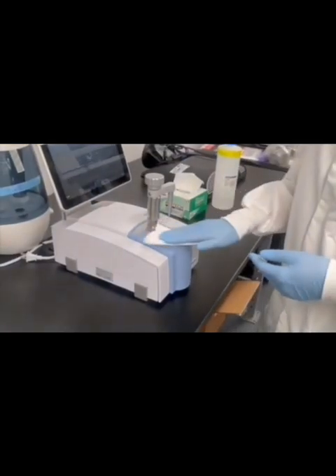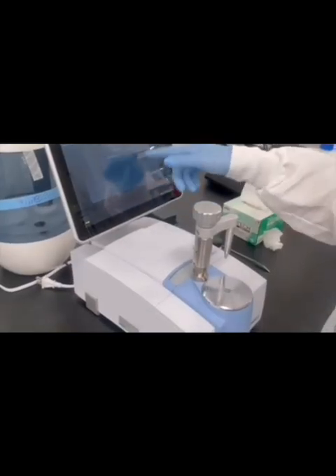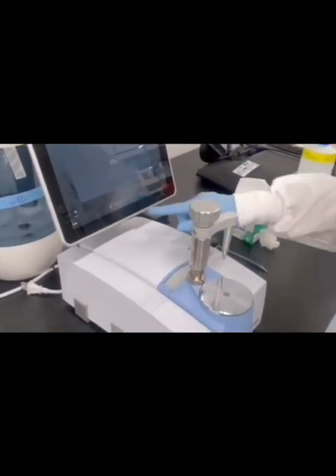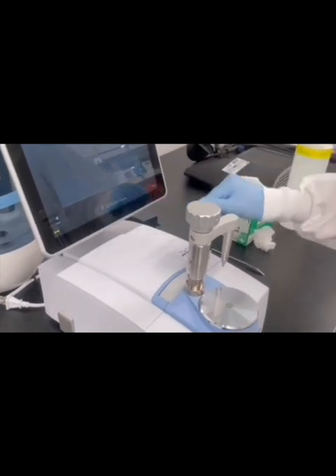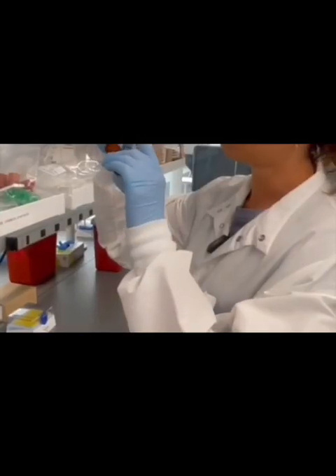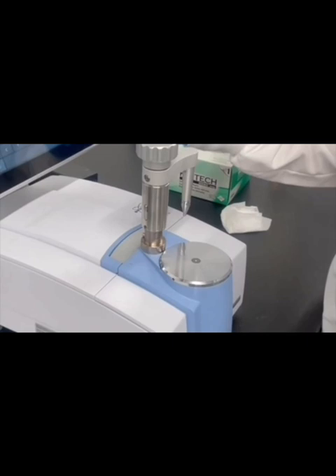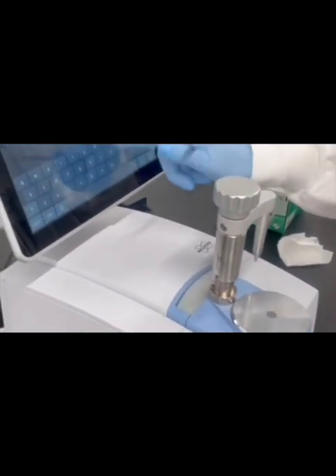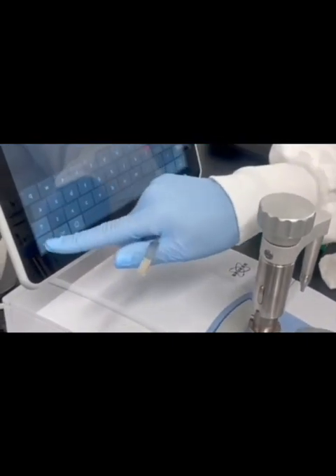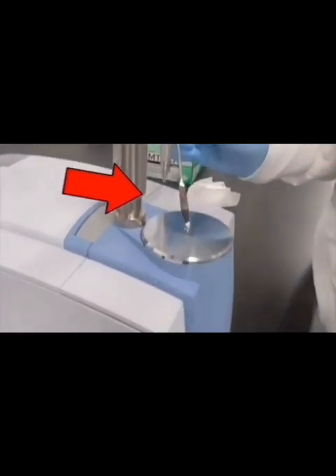The sampling process in FTIR spectroscopy involves several critical steps to ensure correct and reliable results. First is technique. Use transmission, attenuated total reflectance (ATR), diffuse and specular reflectance based on the sample characteristics. Second is collection. Gather healthy leaf samples from the lower canopy in summer to avoid disease interference. Third is preservation. Place the fresh sample in a plastic bag and refrigerate at 10 degrees to maintain integrity.